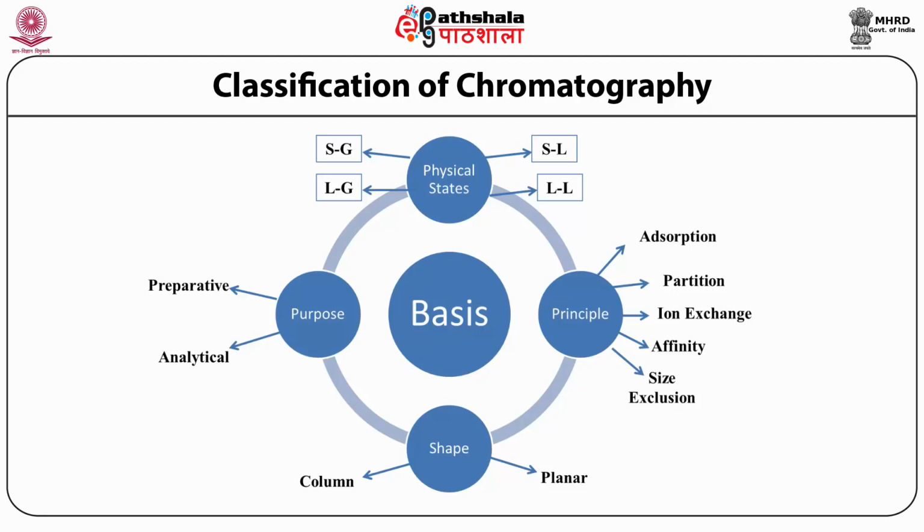On the basis of purpose of chromatography experiment, we can classify the chromatographic separations as preparative chromatography and analytical chromatography. In preparative type of chromatography, the purpose is to separate the components of a mixture for further use, and it is thus a form of purification. Usually, the amount of sample injected or applied is larger, and the separated and pure components are collected for further use. The desired component of sample is retained.